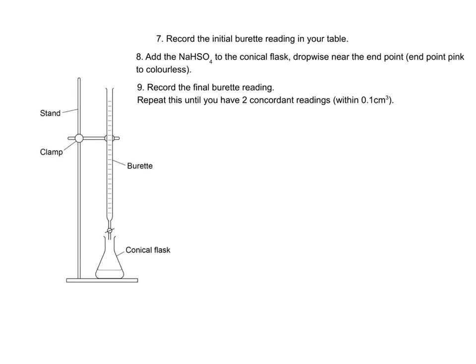Record the final burette reading in your table. Then repeat the titration until you have two concordant results. That's readings within 0.1 centimetre cubed of each other.